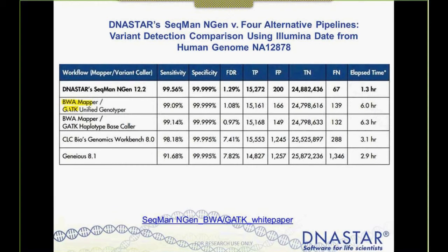So we picked both because we know people use both, and they actually produce different results. So we thought it was important to do that. Then subsequently, we made comparisons to 2 of the commercial competitors that you might see the most, CLC Bio and Geneious. And so this is the last report that we ran, where it's really a summary of many months of work with accuracy.